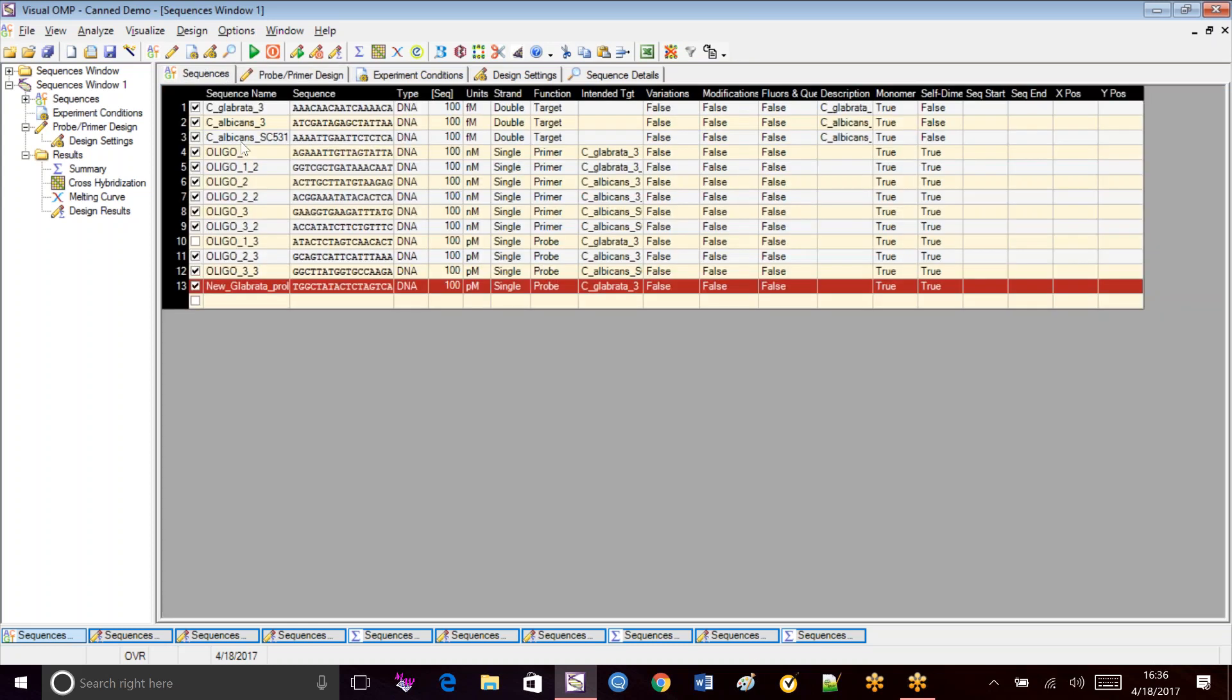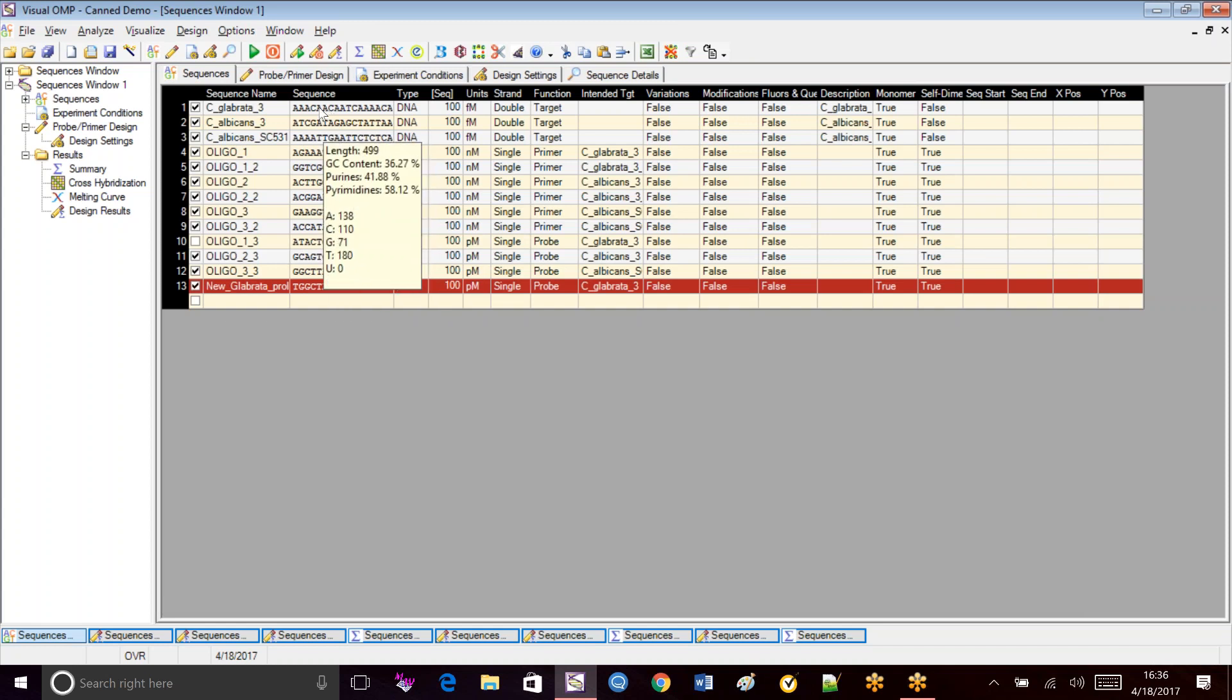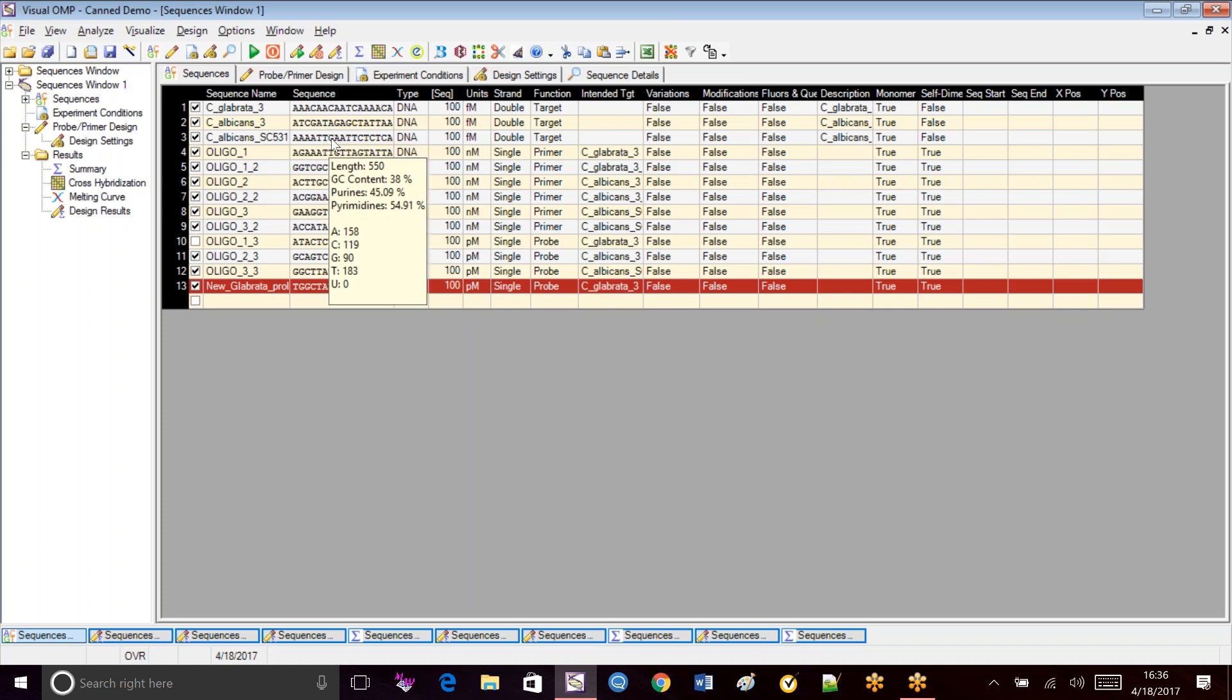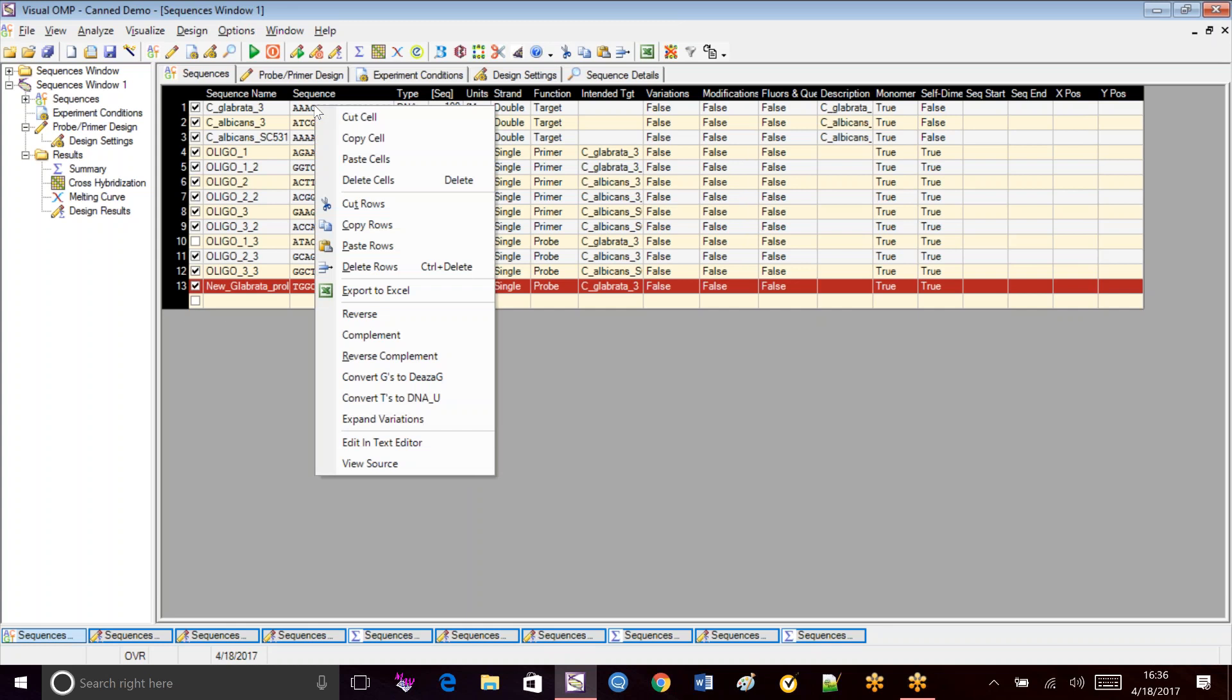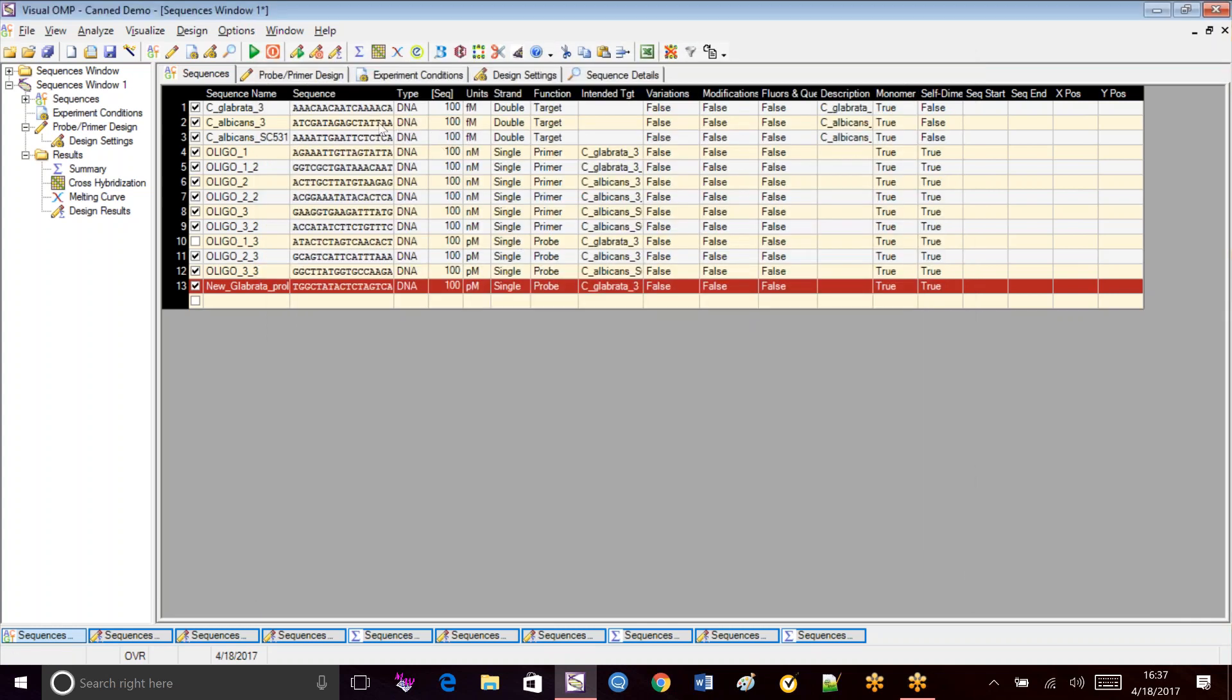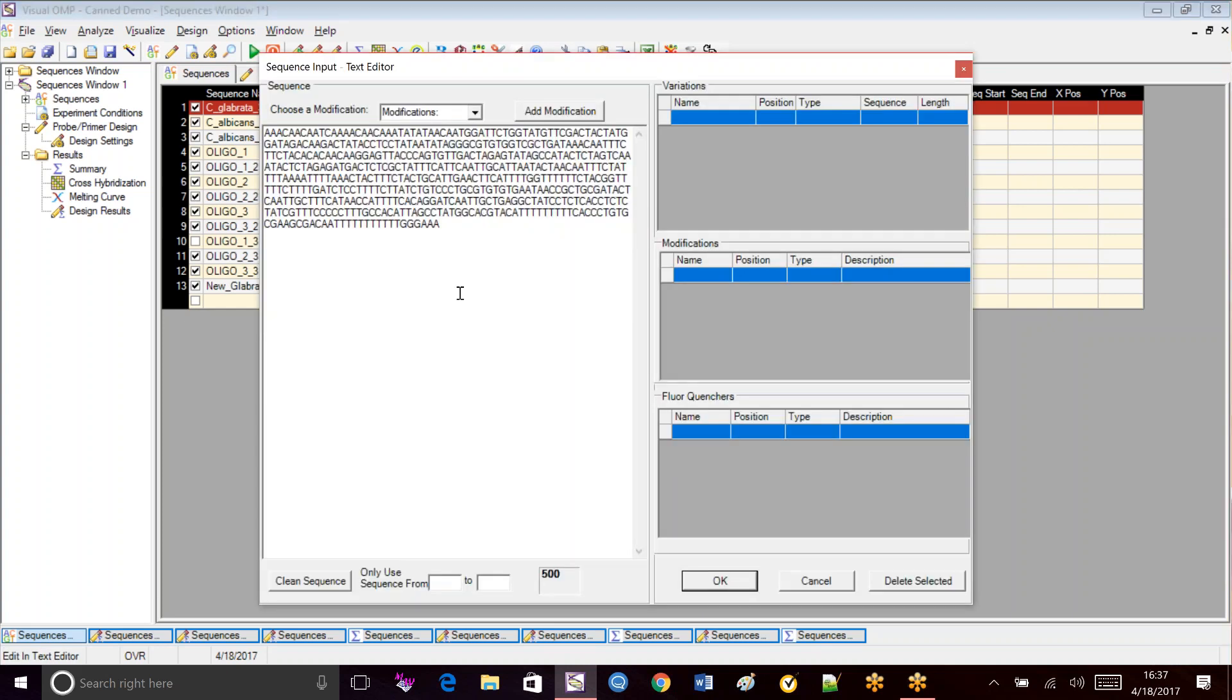And if you look at the sequences window, you'll notice if you hover your pointer over each of the targets, we see the length and the GC content. So the GC content here is only 36%. The second one is 35%. And the next one is 38%. But if we look at Glibrata, we right click, get a drop down menu and edit text editor.